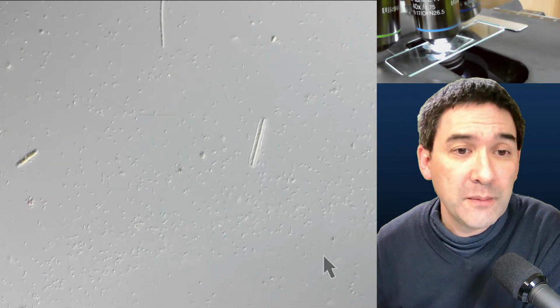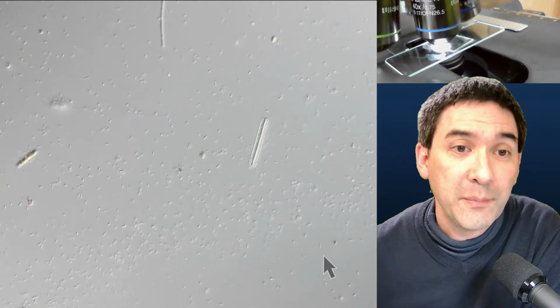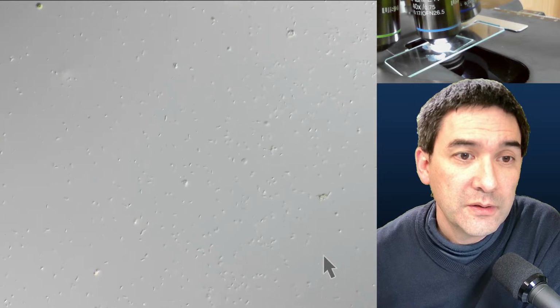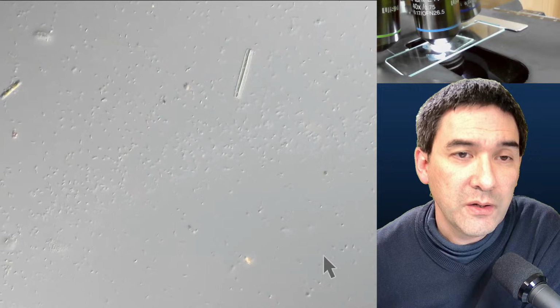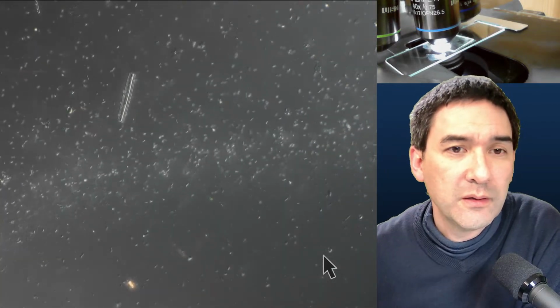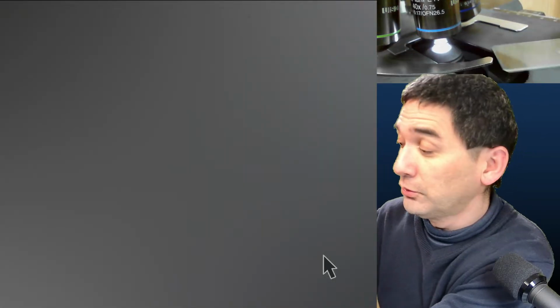You sometimes see also lots of bacteria. By the way, that's also one way that you can determine whether something is producing oxygen or not, is to see if it's able to aggregate bacteria around it. Okay, so let's have a look now if we're able to see it. I don't know if you're able to see it on YouTube as well. Let's now put the whole thing into dark field, other microscope, and I don't know if it's going to be successful or not, but let's try it.